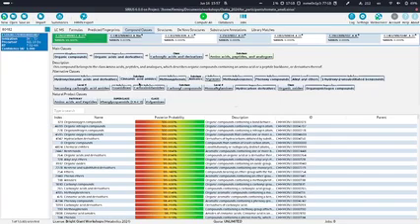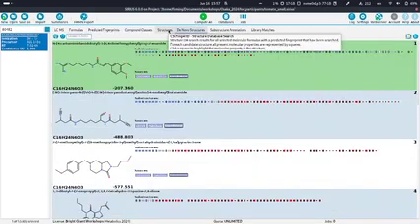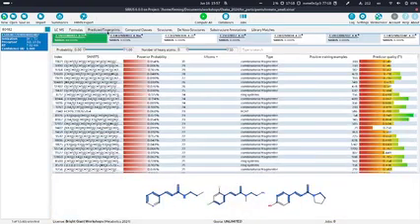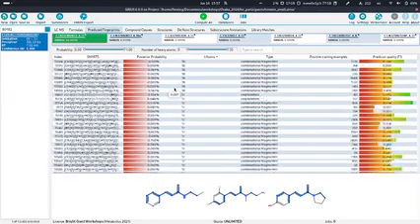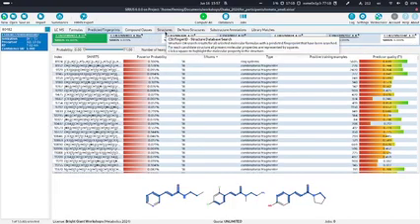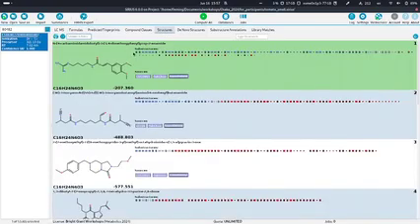We have to be a little bit faster now. Just one thing to highlight here. In the middle we have the substructures from our predicted fingerprints tab, but now the posterior probability is the color of the box. If we go back to the structures, a blue box means that we have predicted the substructure to be present.